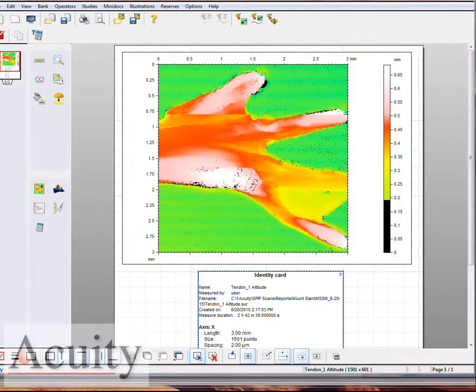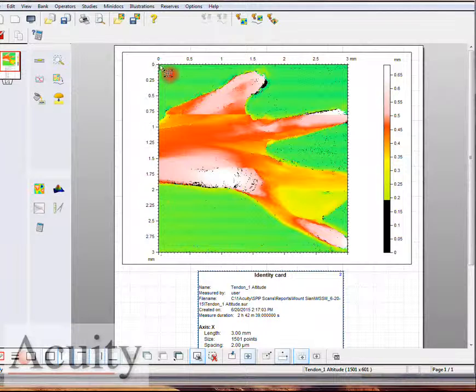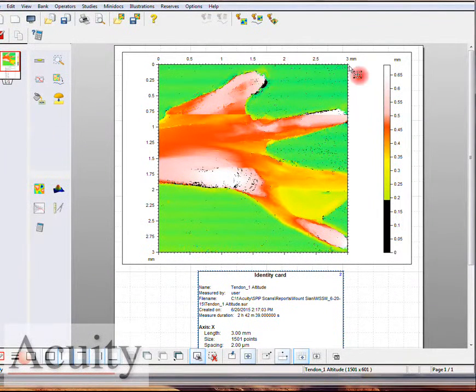Let's go ahead and look at the scan that we did. Here's this scan and you can see we scanned 3 millimeters by 3 millimeters. In the X direction we took a data point every 2 microns, and then we dropped the scan down 5 microns and go over, so we ended up collecting a huge amount of points.